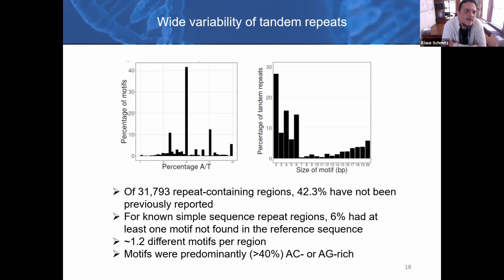Because otherwise, if you want to remove anything rare within your family, you will reduce your power already, because a lot of the rare ones would actually be involved, right? And then you're talking about de novo, so they should not be this rare in the parents, but maybe other families have it, or maybe the father or something.